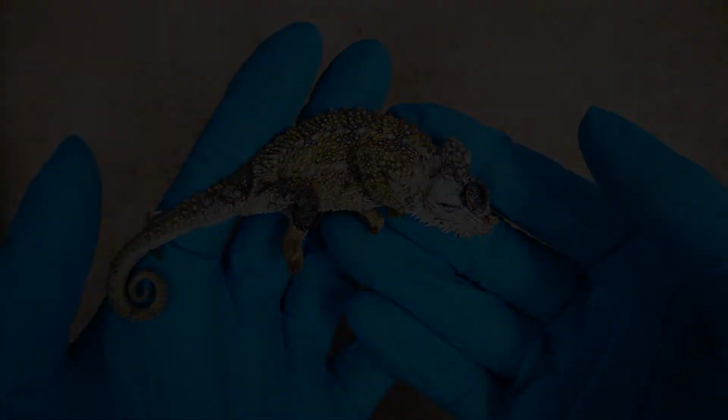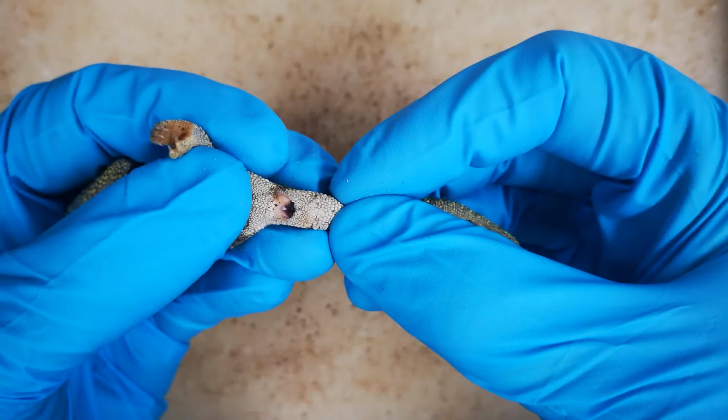To prepare the hemipenis, the deceased reptile is held in one hand, while manipulation and preparation are carried out with the other. For left-handed people, it may be convenient to mirror the approach shown here in right-hand view. Note also that preparation technique differs a little depending on the squamate group being prepared, because lizards that can drop their tails require a little more care during manipulation.